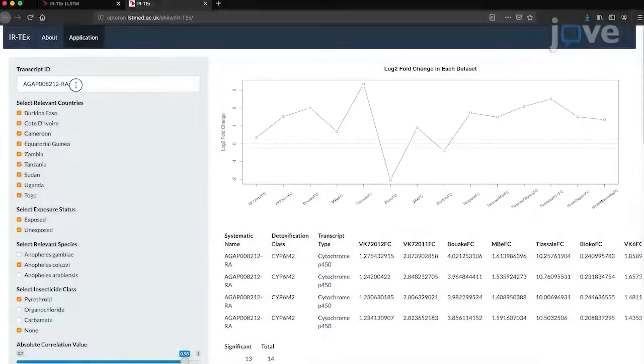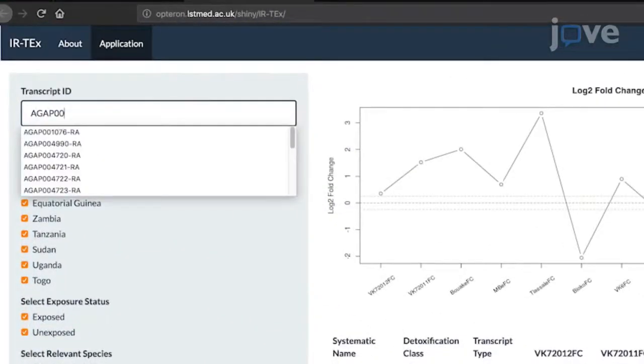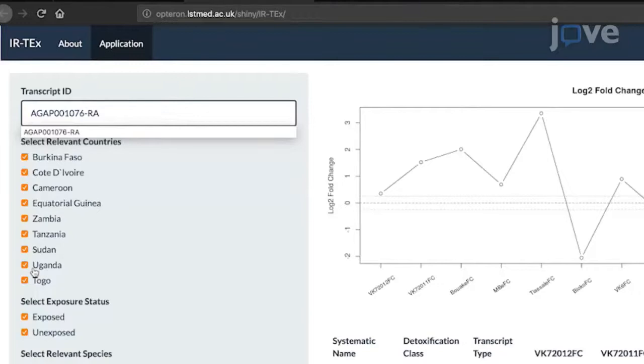To explore expression of a transcript of interest, first select the transcript. Then, input the transcript ID into the transcript ID box, remembering that the transcripts end in hyphen Rx dependent upon the isoform of interest.